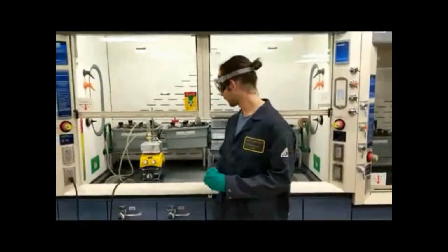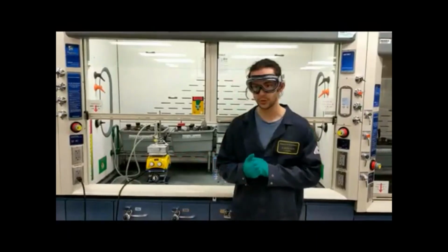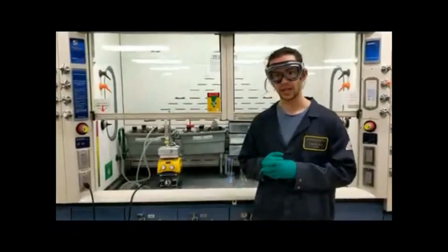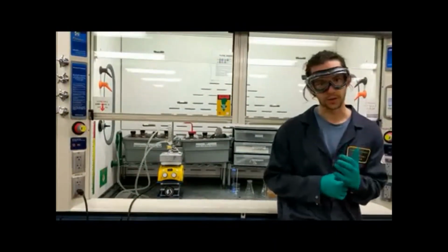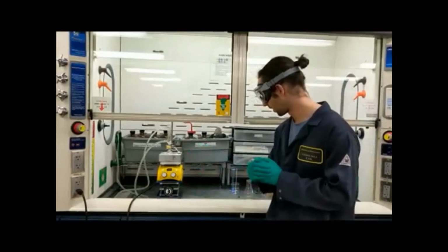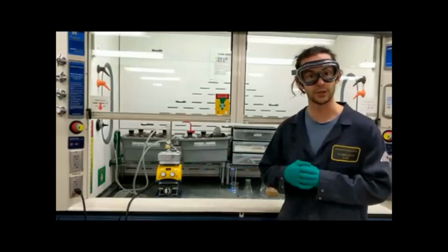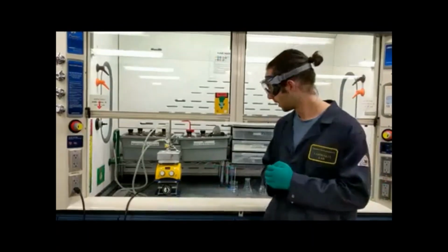So at this point, we've measured out the reagents that we need and we've started the reflux. In this flask, we have 0.25 grams of our given amine, whether that be the R or S stereoisomer, as well as 0.25 grams of biphenyl 4-carboxaldehyde and the ethanol in order to reflux the reaction. We'll essentially let this reflux for about 15 minutes or so and then start cooling the reaction down in order to isolate our final product.